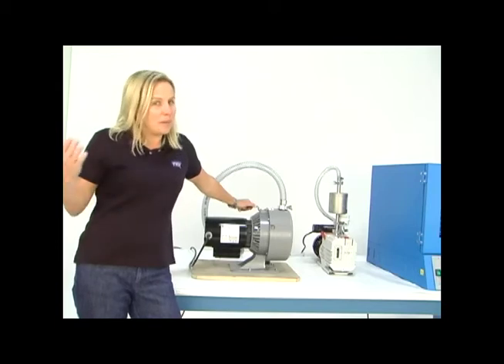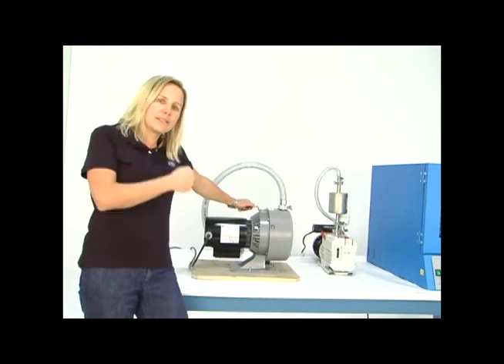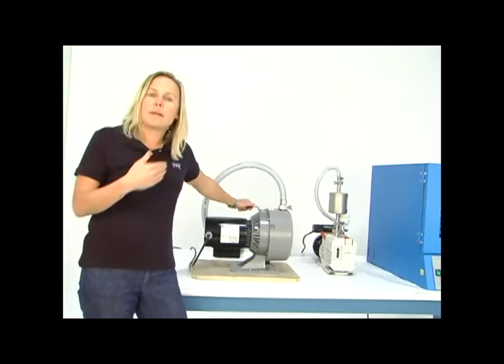What you have to do is buy the tip seals, take the pump offline, open up the pump, get inside it, take the old seals out, and put the new seals in.